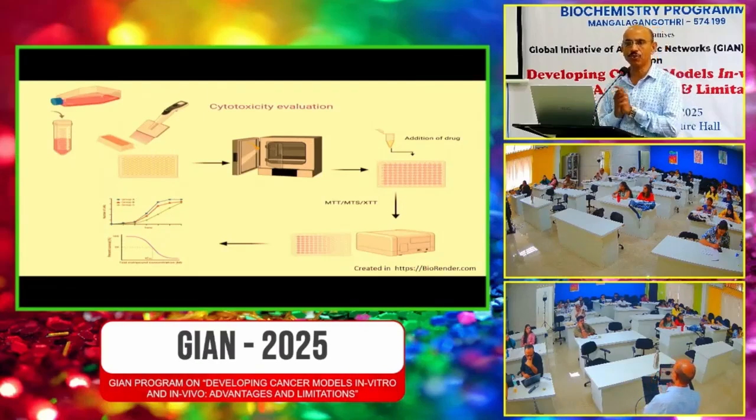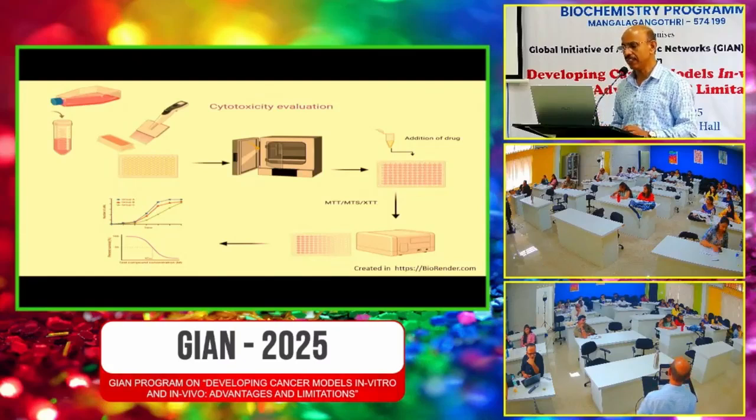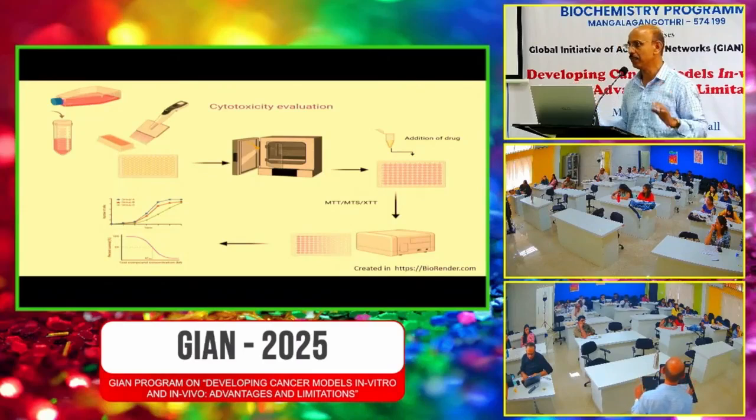For those who are not familiar, because there are some MSc students, yesterday also I mentioned what a cytotoxic study is. We take the cells, detach the cells which are grown in culture, and take them in a plate which we call a microplate. We add the drug and incubate, and later we find the absorbance and find out the action of the drug. This is the simple theory behind the cytotoxic assay.